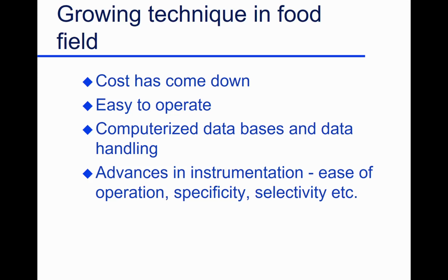Three years ago, that didn't exist. We couldn't get so fine, know exactly what's there in this particle. Costs have come down. I'll qualify that. To run a sample here, it's $1,050 for one sample because the equipment's someplace around $4 million. Okay, that's on the expensive side. But the cost has come down enough now that we can buy one, put it in our laboratory. Like I say, we've got 4 of them in our lab. And so that's taken out of the hands of experts, out of people with big money, putting it into our hands and into the food industry laboratories.